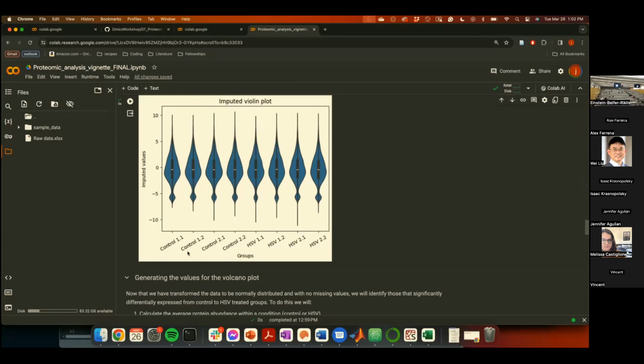So 0.3, what does it mean? It means that when you impute a value, you are in that range of the graph. So that value will probably be -6, -5, in that range. If you multiply by 0.3, then you squeeze the range where that value is imputed. Now that value can only be -6, -6.3, just within that range only. Because we don't want the imputed value to be too variable, right? Because then we overestimate the variance of values that are not detectable.